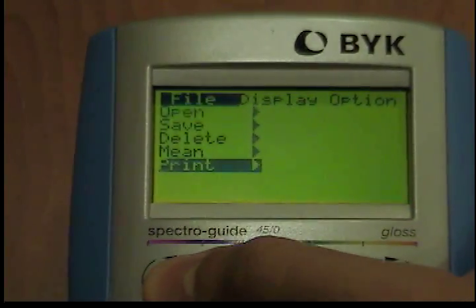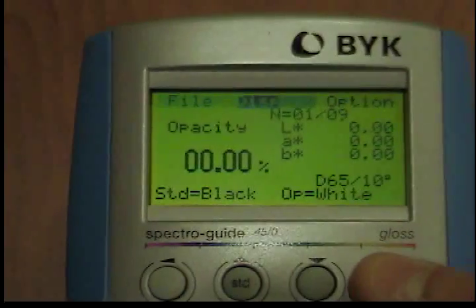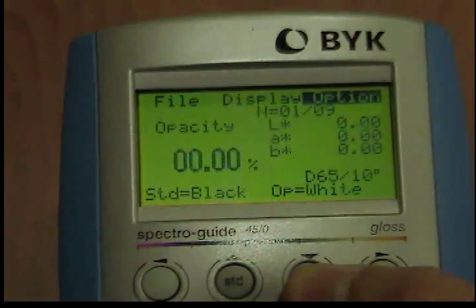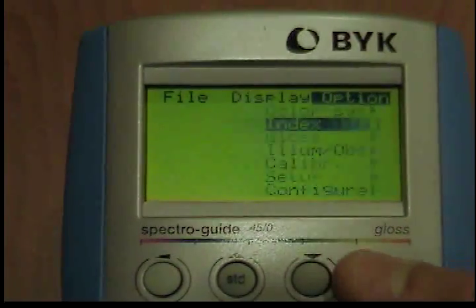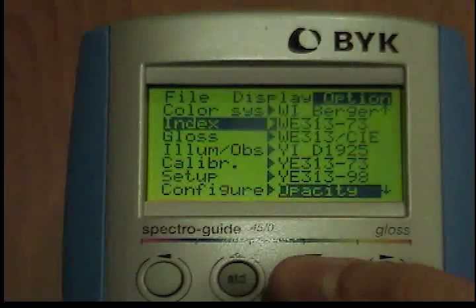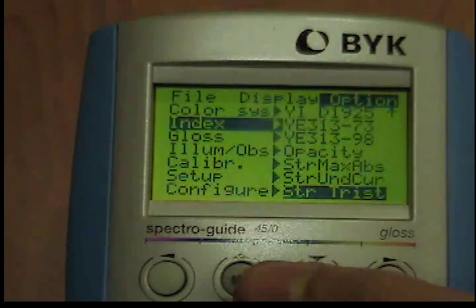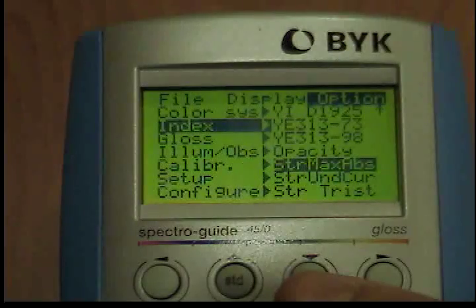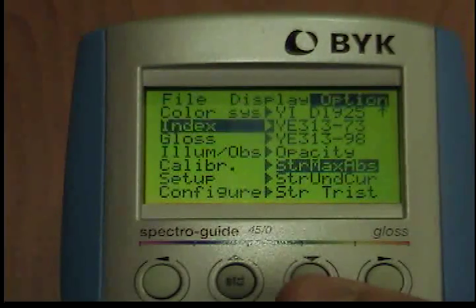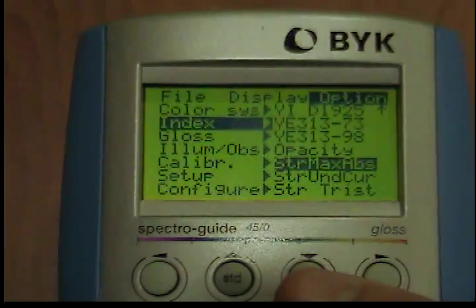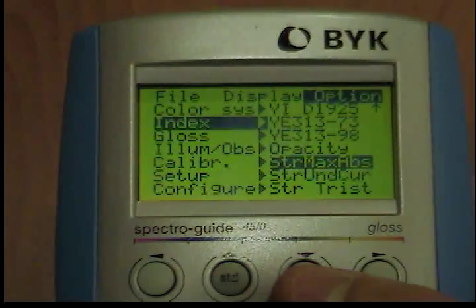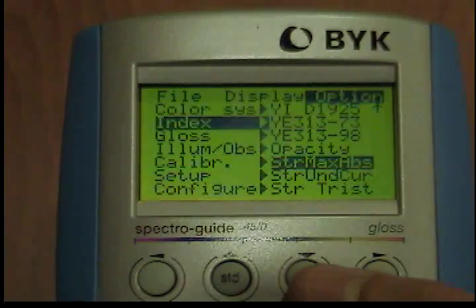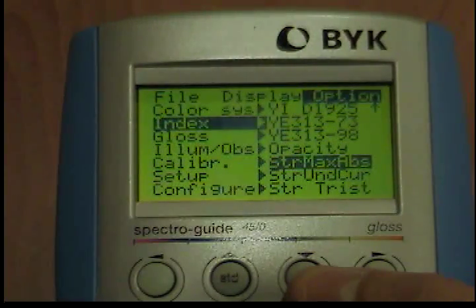Color Strength. This function can only be performed in difference mode. To activate this function, move the cursor to the Color Strength option in the manner described for the option index menu. The instrument will return to the measuring mode. After Color Strength has been selected, all of the values on the display are set to zero. To display the Color Strength, use the up button to measure the standard. Use the operate button to measure the sample.